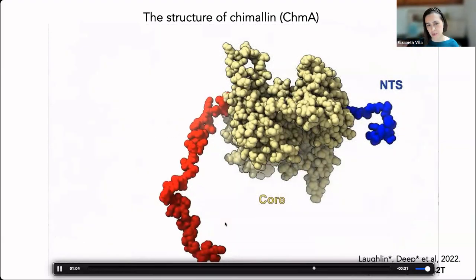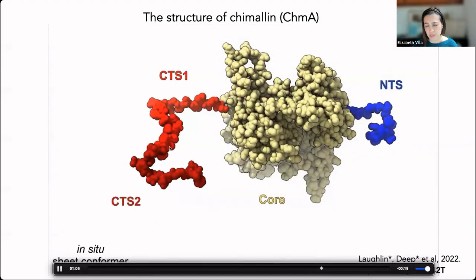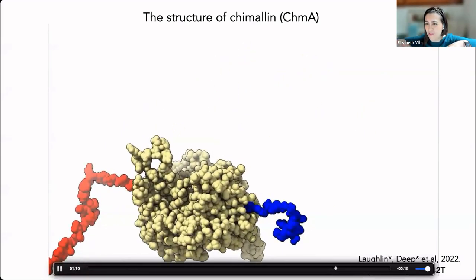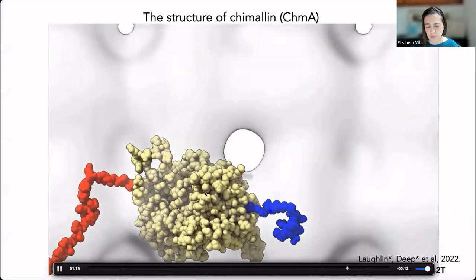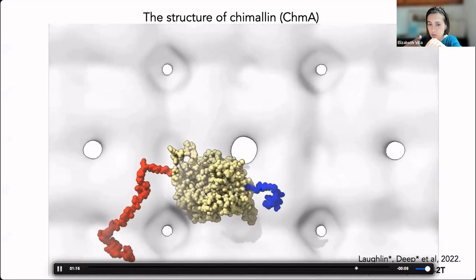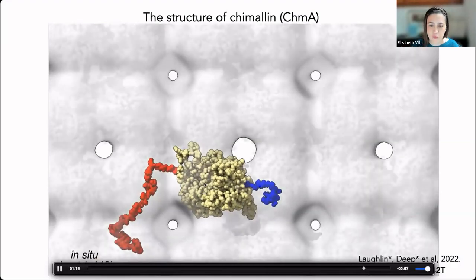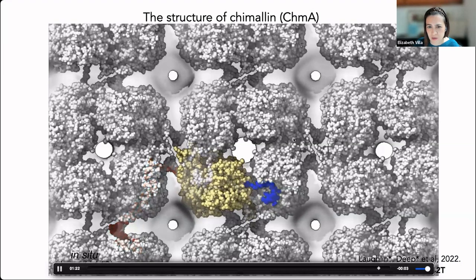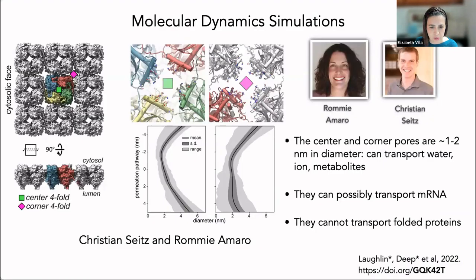And then Tom showed that the rigid body molecule of the C terminus actually allows you to go into the flat surface. So this incredible variability and flexibility and curvature is possible with these two domains that really even allows you to go from a threefold cube corner to a fourfold in a sheet. So Tom assembled the sheet of the tetramer, and you can see that there are some holes in here, and we wanted to know if these holes would be sufficient to export and import proteins.